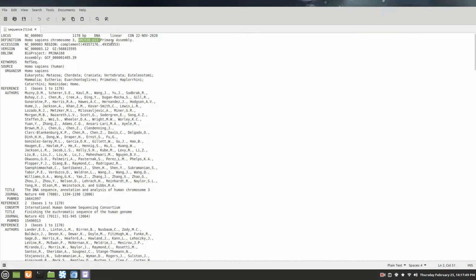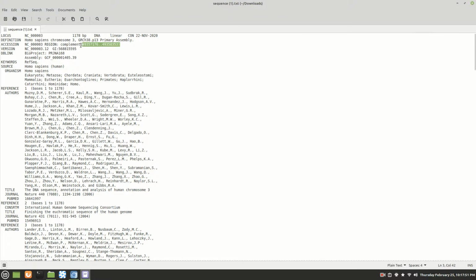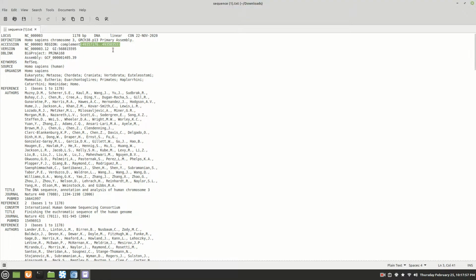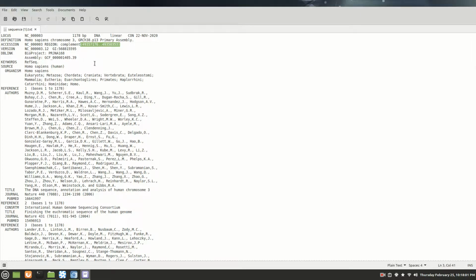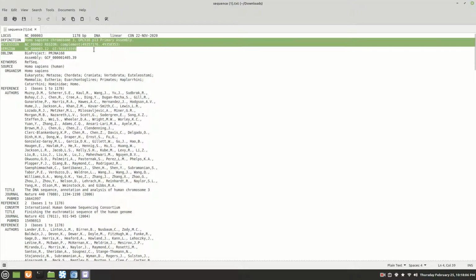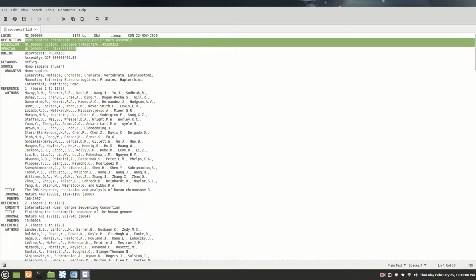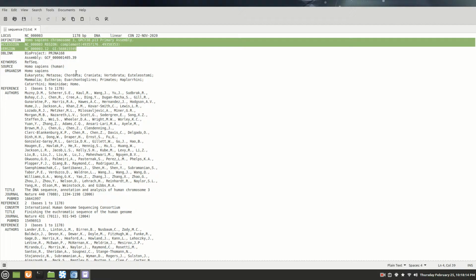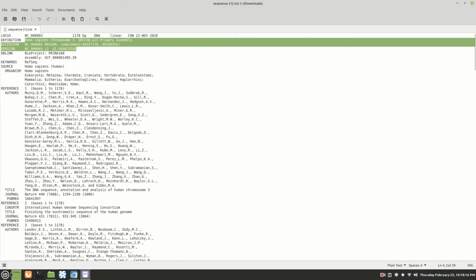You need the start site, and now this is the complement. So realize it really doesn't matter. This is good enough. We can start with that as long as you download that. We can fix it later, but the information you need is right here. All right, so that we can just start and make our little database, and then we can figure things out later. But all the information you would need is right there. I'll make a new text file with just that information.